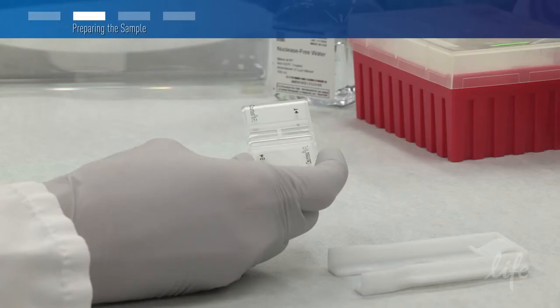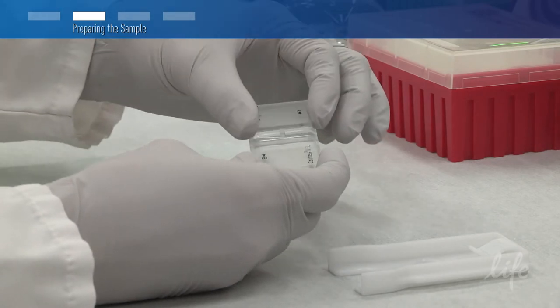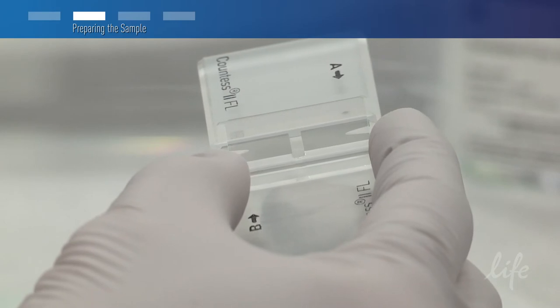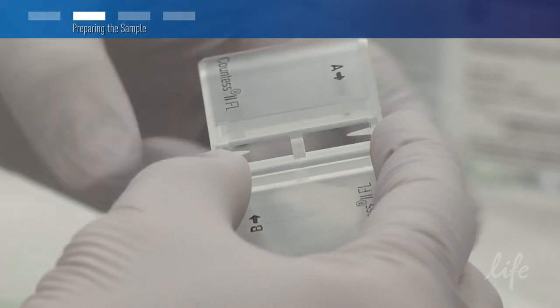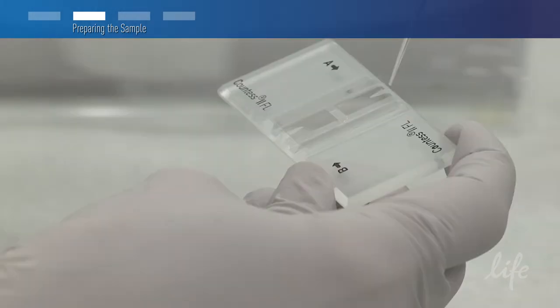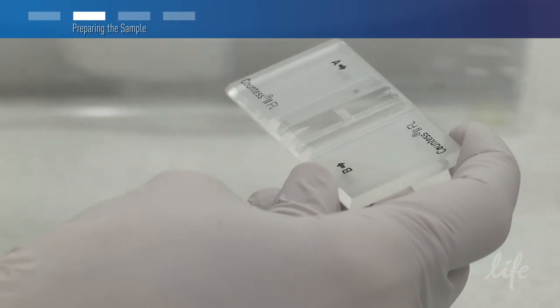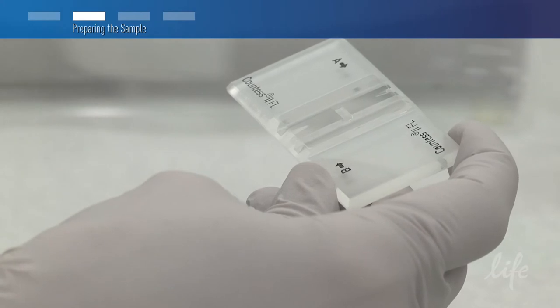To prepare your sample, first center the glass cover slip over the ports on the hemocytometer. Next, deliver your 10 microliter sample into one of the notches via a pipette tip. Place the pipette tip at the edge of the sample port and then slowly dispense your 10 microliter volume into the notch. The sample will then be drawn into one side of the hemocytometer.